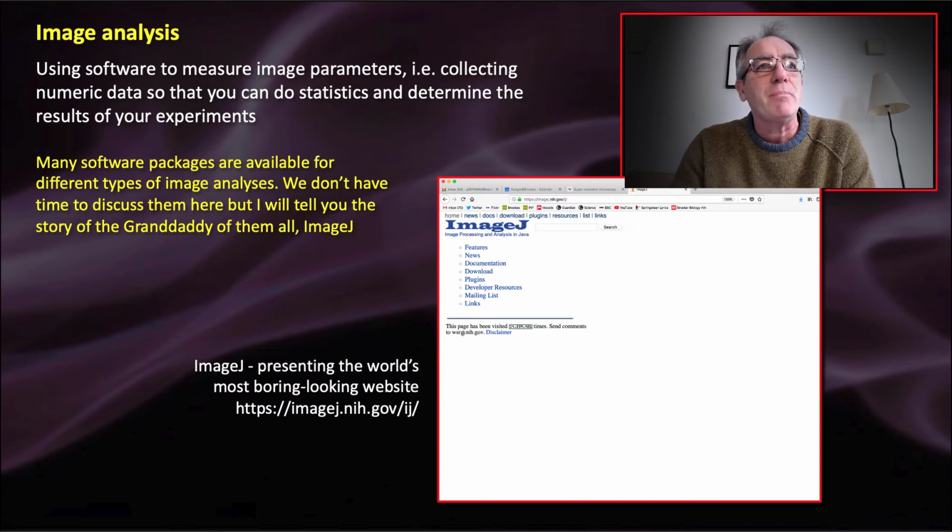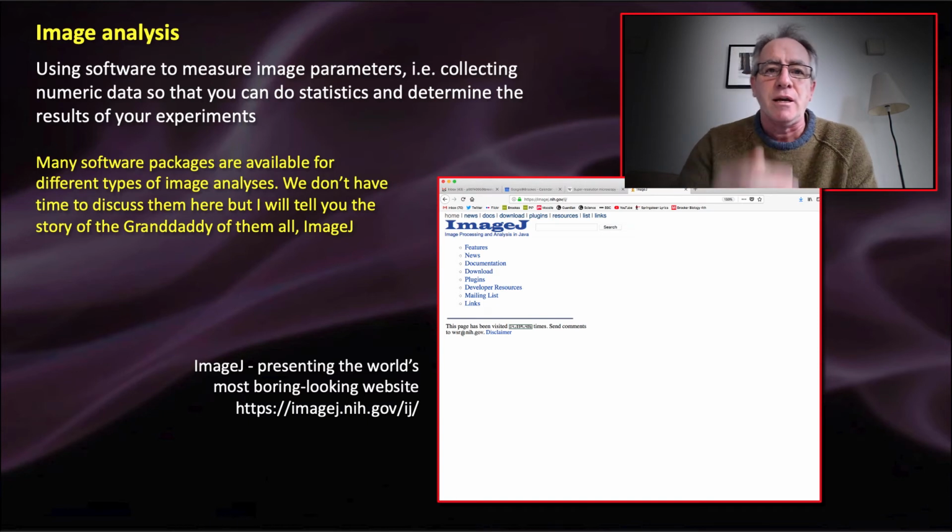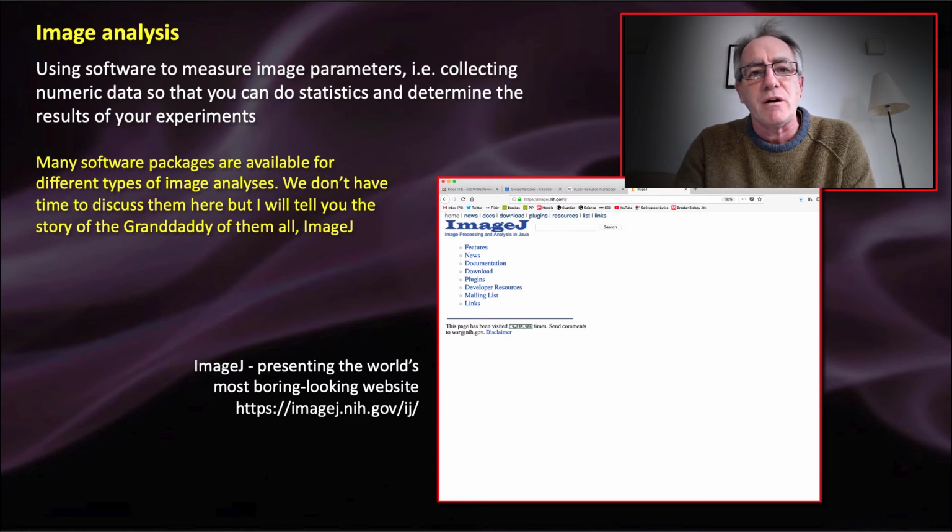In some of our FRAP experiments, we will collect 300 images as fast as we can, one image after the other, 300 images stored into the memory of the microscope. What do you do with all that data?